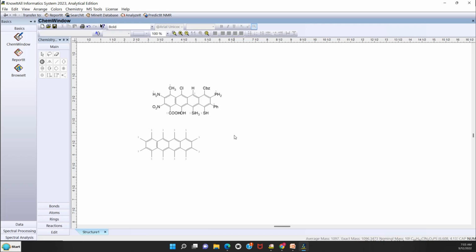I drew another ring to work on to show you some more atoms that you can put in. So I'll hover over this one. This time I'll type B, and you get bromine. If you hold the Shift key while you type B, you get boron. The next one would be iodine. So another common one. Let's see what happens if you hold the Shift key and do iodine. There's nothing assigned for that.